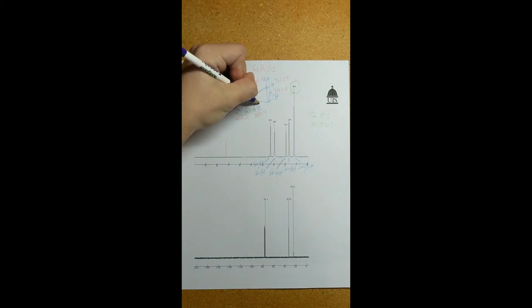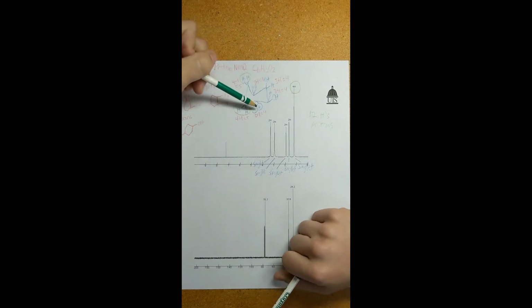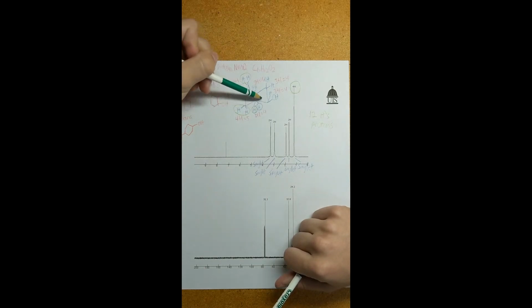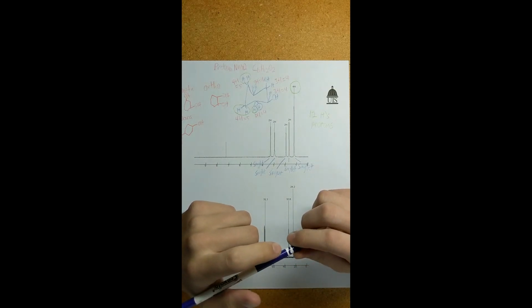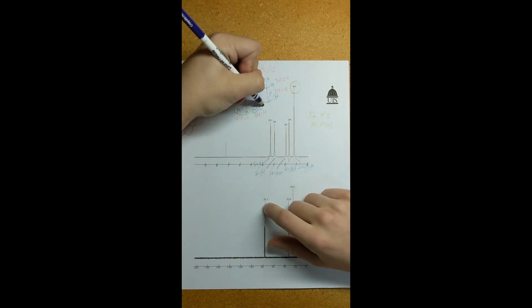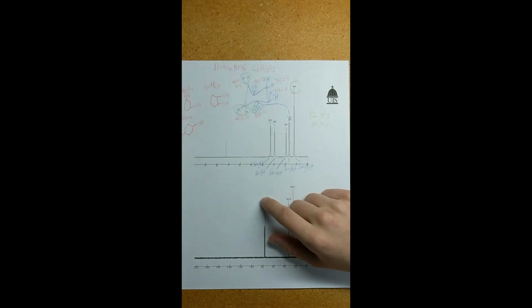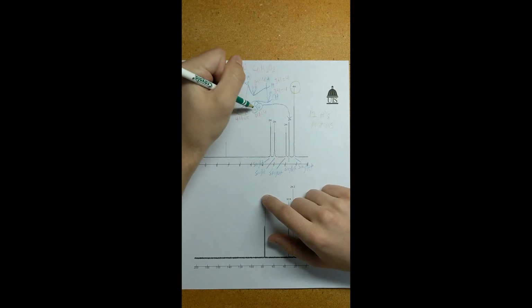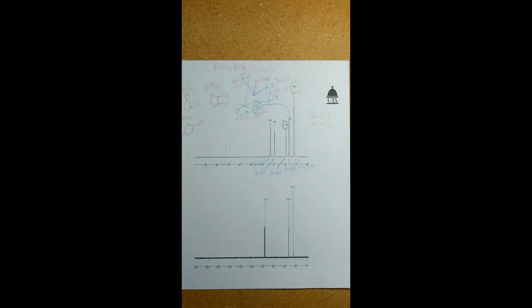So that tells me that these hydrogen groups are actually going to be in their own environments. Therefore, labeling these separately is the only way for it to work. And again, just looking at how this is drawn, which is closer to the alcohol groups, we're going to see that this proton is going to fulfill this peak, whereas this hydrogen, the green one, not to gum it up with too many arrows, will fulfill this. This is quite a difficult structure, and that proves why.